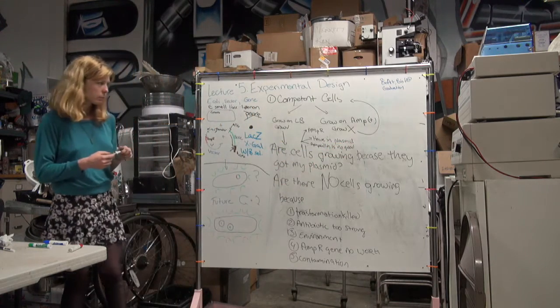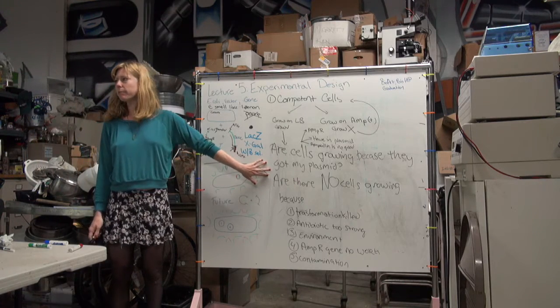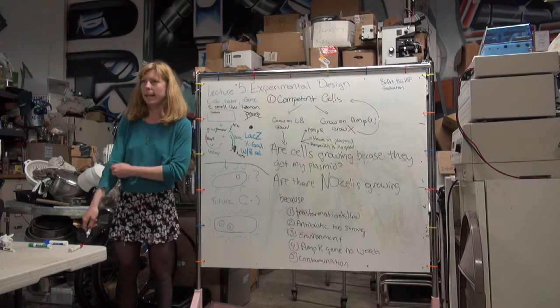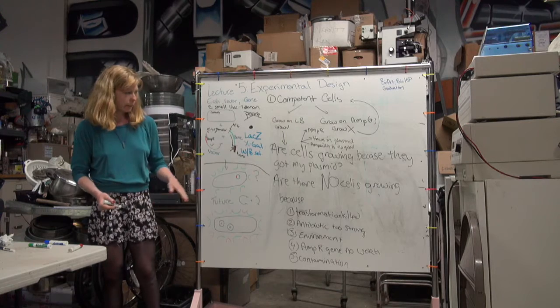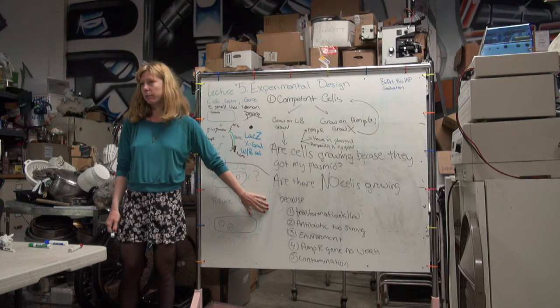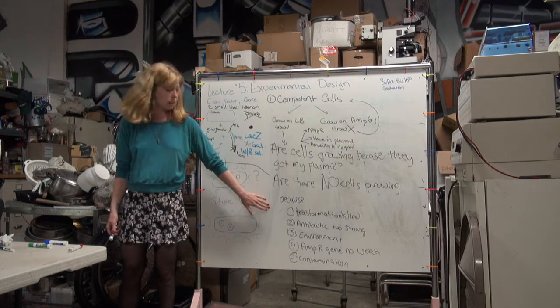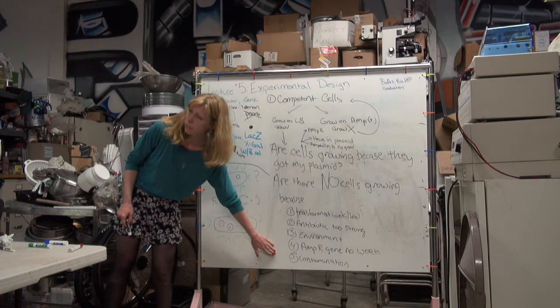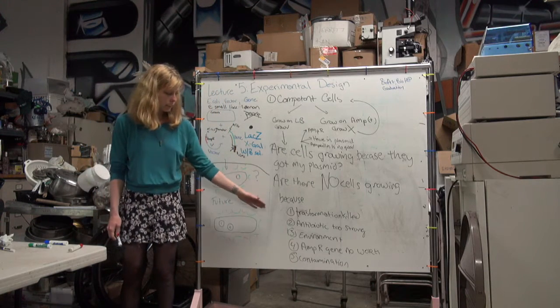So these are the 2 questions that I'm asking. These are all the hypotheses of what could be happening, and if the cells don't grow, something went wrong, right? I didn't have any success. These are all the reasons for a false negative, right? So when I'm troubleshooting, I'm like, all right, here are the reasons.